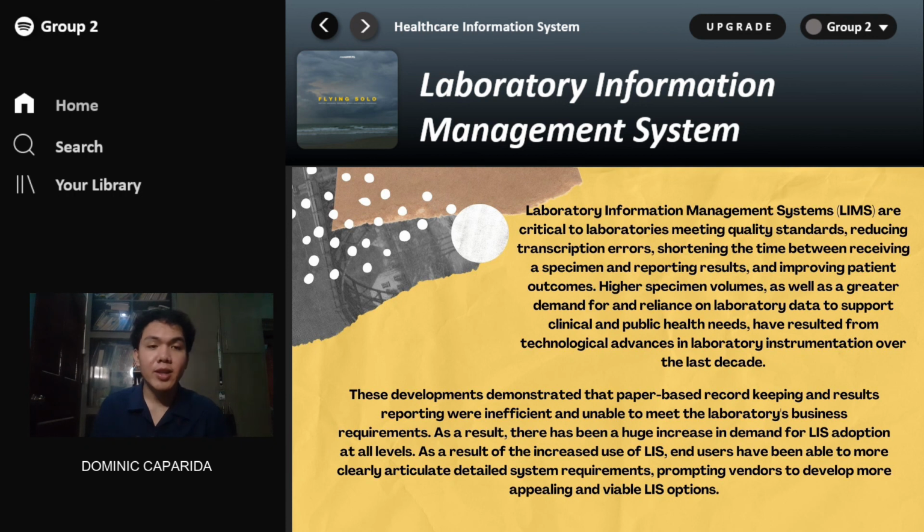So all in all, the main contribution of the Laboratory Information Management System, or LIMS, to the modernization of laboratories is that it ensures the accuracy of the test results. It reduces or eliminates errors. It drives the staff's efficiency. It increases the productivity. Overall, it provides better health services in storing and collecting data from the patient.